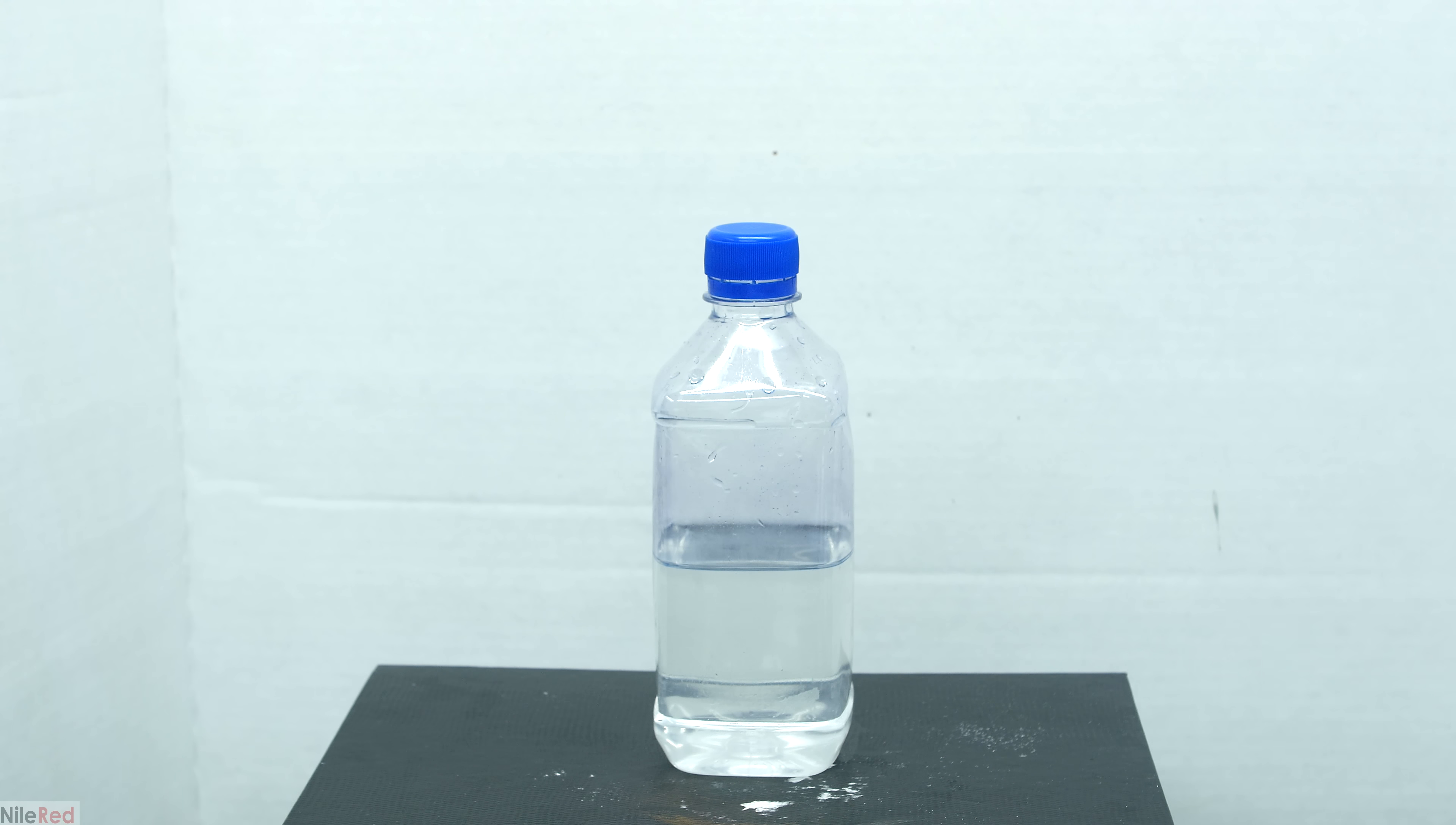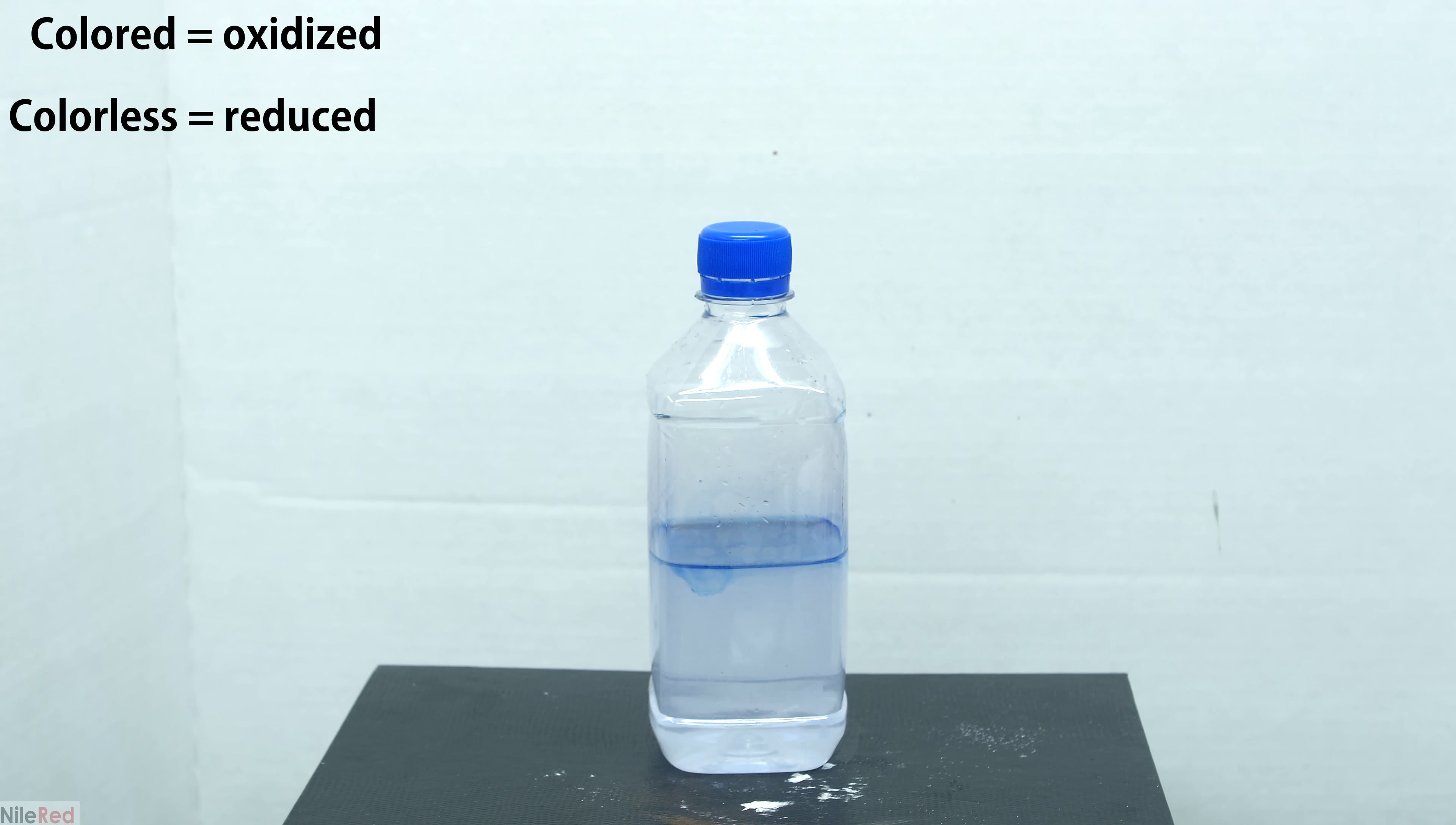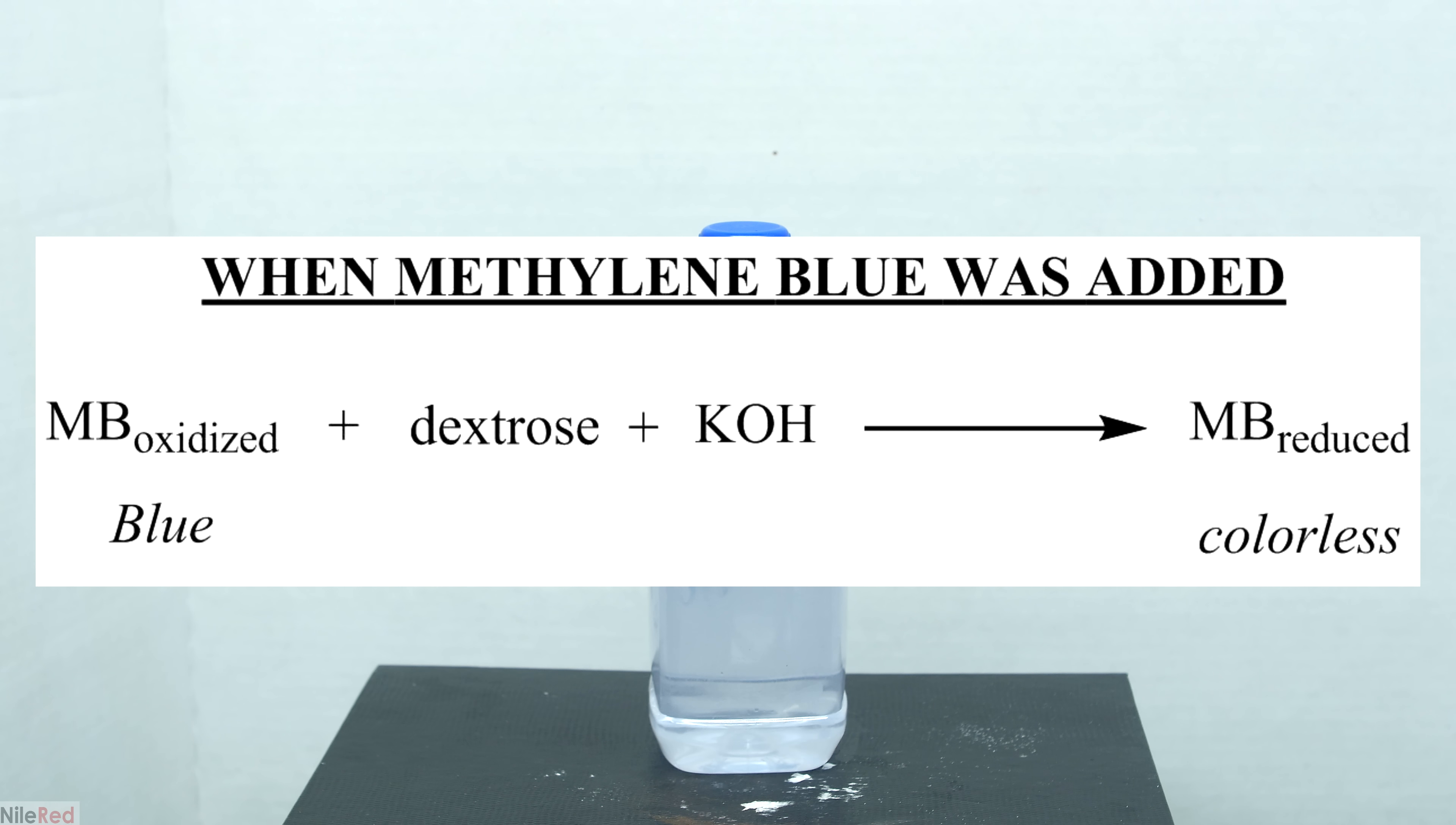The methylene blue indicator that we're using actually has two different forms where one is colored and one is colorless. The colored form of the methylene blue is its oxidized form and its reduced form is colorless. During the preparation of this demonstration we had colored methylene blue which means that it was oxidized but when we added it to the dextrose potassium hydroxide mixture it was reduced to its colorless form.